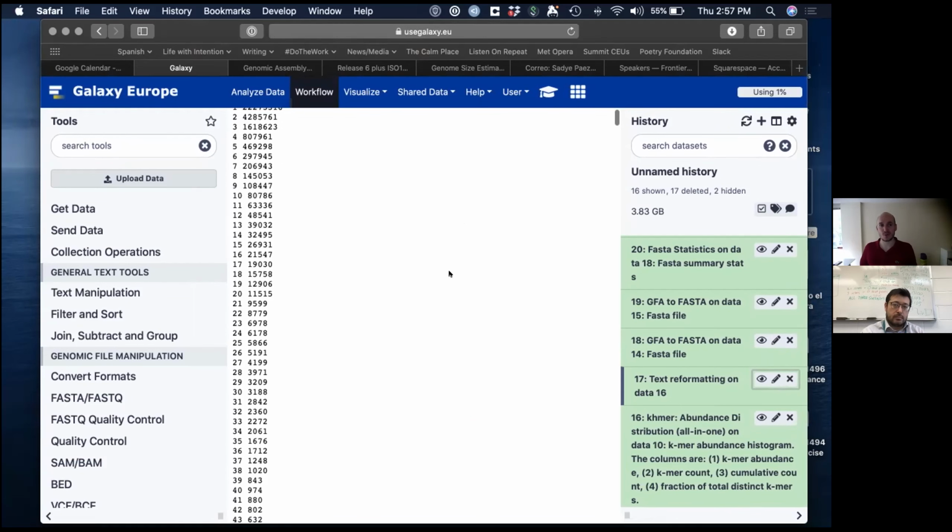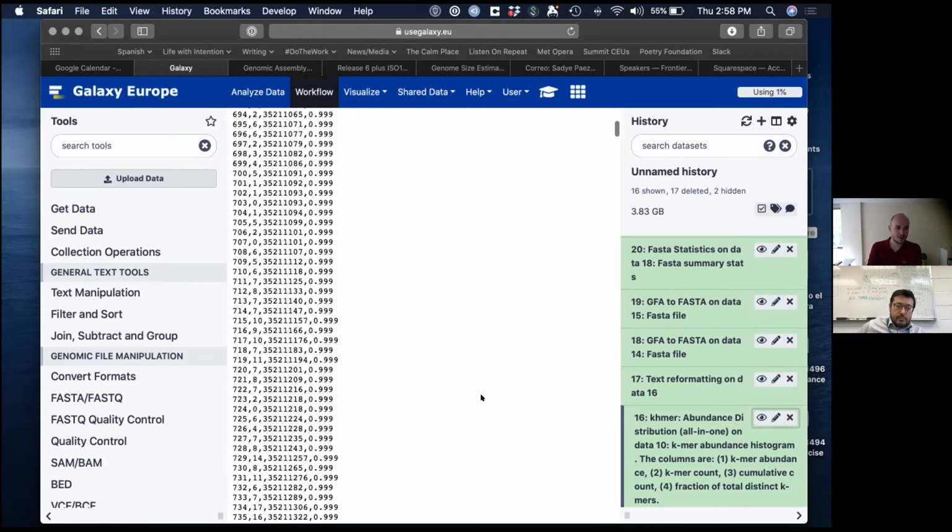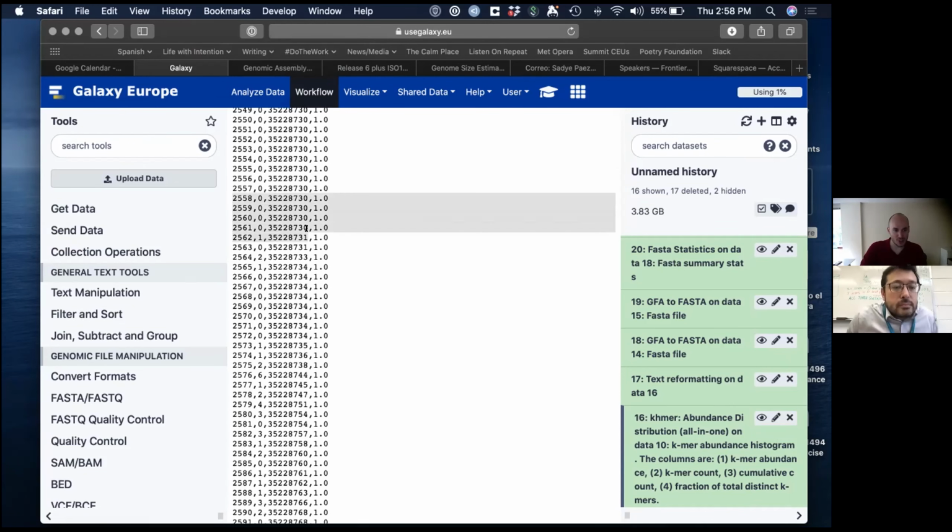So this allows us to run GenomeScope. Have you tried that? We also removed the header. Oh, and we removed something more than that. Now I'm going to explain how you read the AWK again. We also removed all the coverage values that were at 0 frequency. When we go to the highly repetitive stuff, if you scroll down a lot, you see that there are many 0 values, actually all of them are 0. And this is not really necessary for GenomeScope to work.